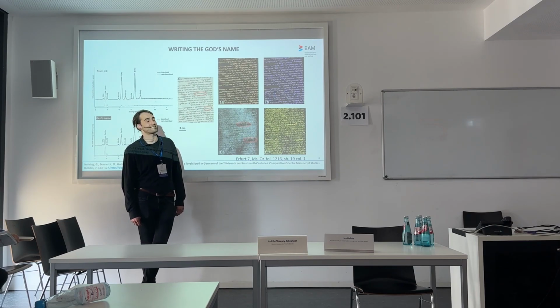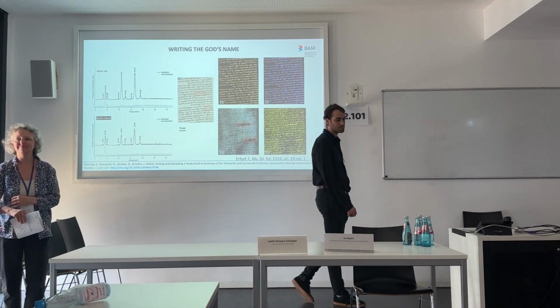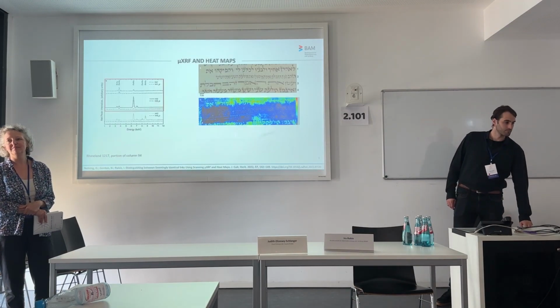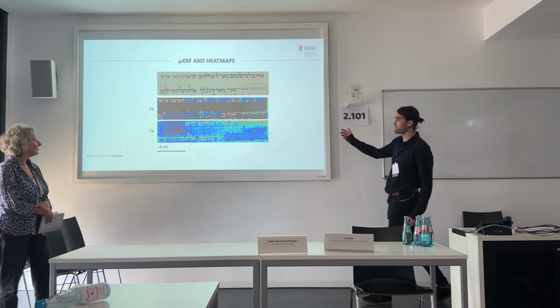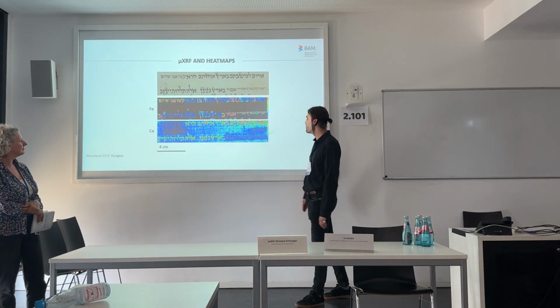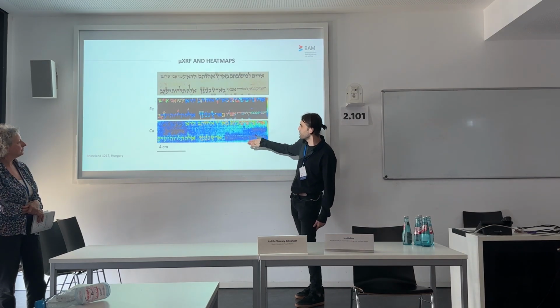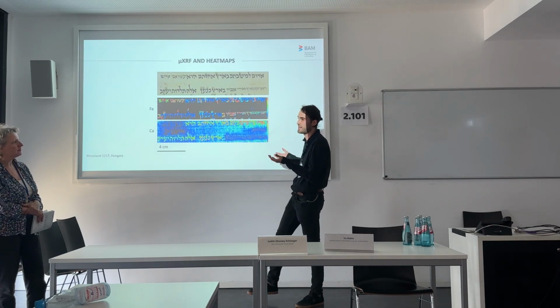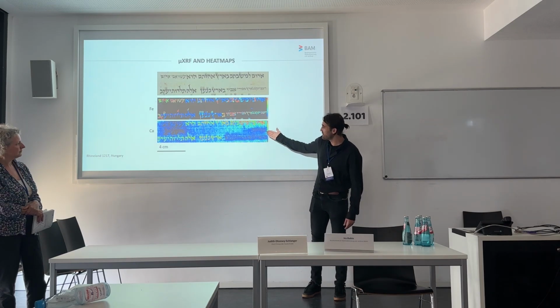Okay. So basically, when the scribe went through correcting this scroll, he added also the name of God. Yeah, I understand that. In this case, the scribe used a different technique for removing the text. He was following the shapes of the letters with some probably very sharp tool. He also removed the calcium, which is one of the most abundant elements present in parchment. Therefore, in the negative, we can here read what was erased here.